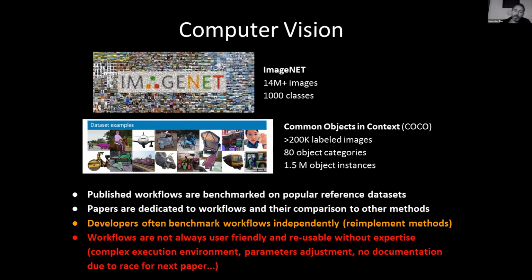Sometimes you had to compile code or have some specific operating system to run them. Also, the documentation was not always super detailed, mostly because people were racing for the next paper. So once something was out, they were already thinking of the next one and not so much about making their tools usable and used by many people.